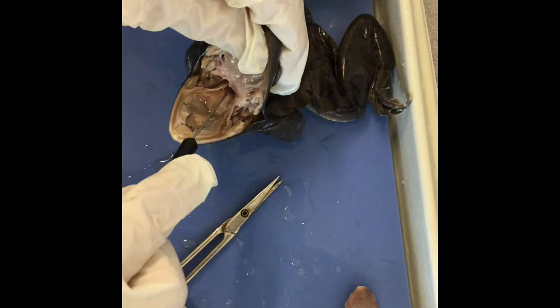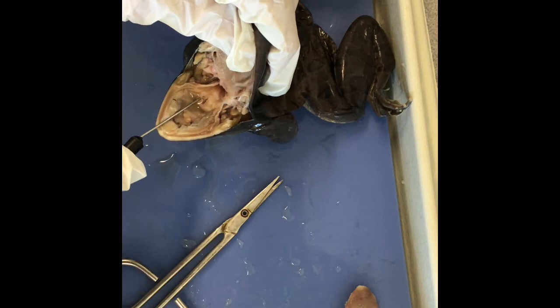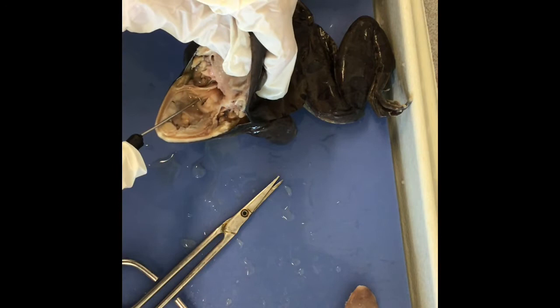Once we're in the frog's mouth, a few obvious features. There is the esophagus, which is where the food goes down — it's essentially just the hole that's going to lead to the digestive system. There's a little slit right here, and that is the glottis. That allows the frog to make sound and it connects to its respiratory tract.